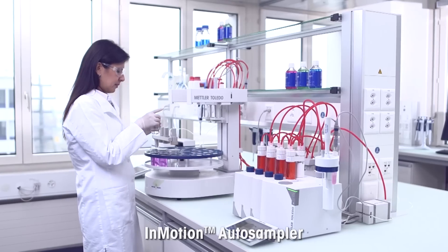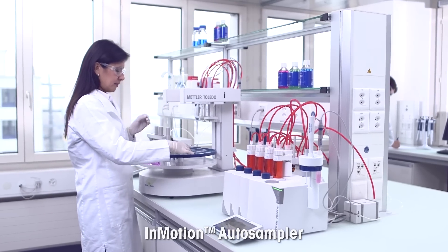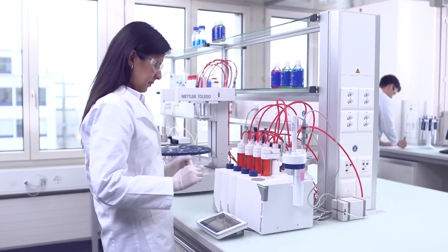InMotion AutoSamplers are designed to assist in every way for flexible workflows and efficient analysis.